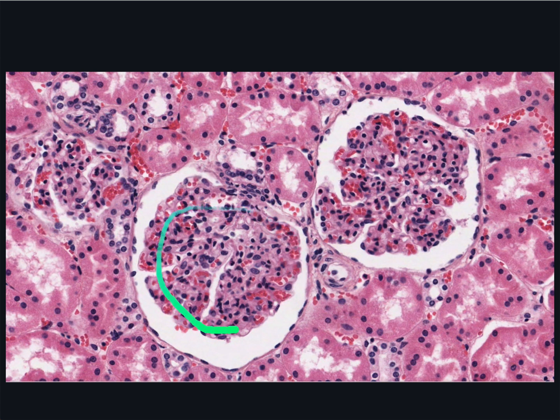It's not feasible to distinguish podocytes from endothelial cells in the glomerulus, but probably a large rounded nucleus, such as this one, and also this one, are most likely belonging to a podocyte. Nor can one satisfactorily identify mesangial cells in a thick section such as this. But needless to say, the vast numbers of red blood cells visible here tells you that these glomeruli are indeed a tightly coiled tuft of capillaries.